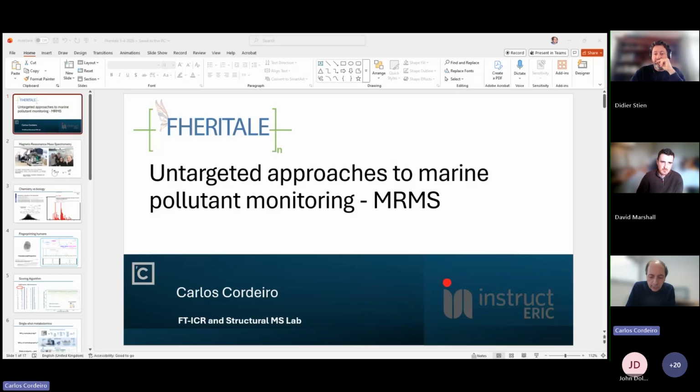Yeah, I think that would be quite interesting to do, actually, how these microbes react and how the presence of the pollutants affects the chemical fingerprint that we see. Of course, we are making the first steps. We are working with individual cultures and also with mixtures, that means consortia that can have 4 or 5 different bacteria.